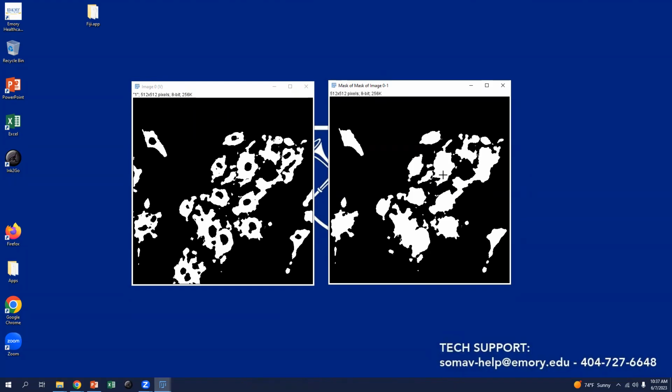What if we wanted to measure intensities only in the areas and exclude anything in the holes? There's very little in there, but still we don't want it to complicate our analysis. Well, the way that the particle analyzer works is it measures the outer boundary of the structure. So it doesn't actually keep any of the information about the internals.